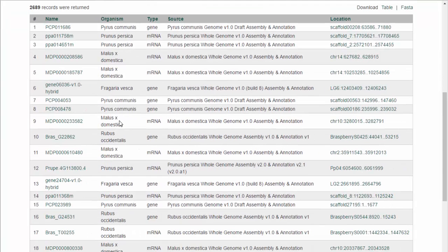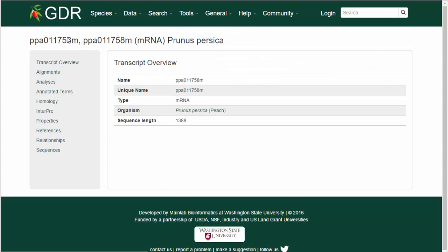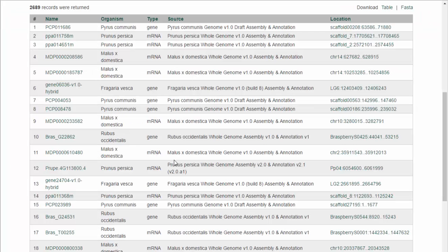As an example of the information in the table links, the link in the name column takes you to more details about the gene or transcript. The location column takes you to view the feature in GBrowse.